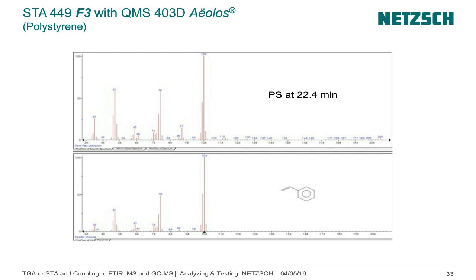But with polymers, if I would take polyethylene, for example, there are hundreds of substances which are involved, and then it becomes really, really hard to detect which substances are involved. But there we will come a little bit later to it.